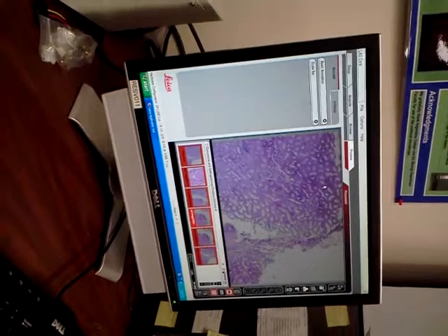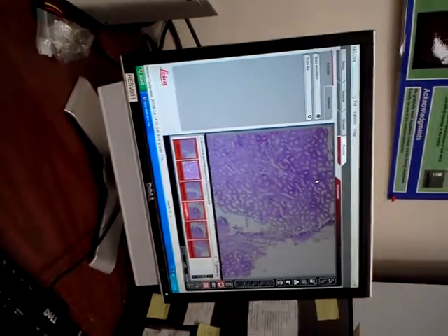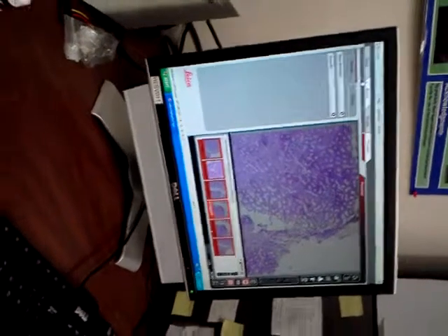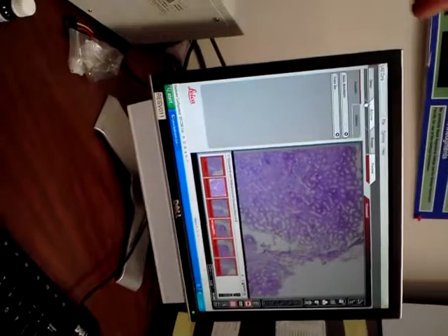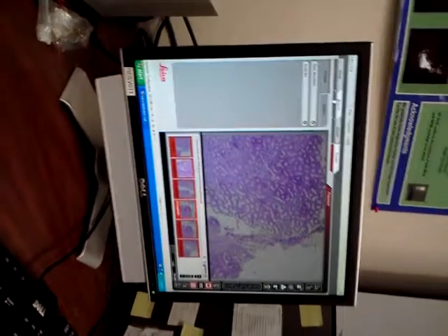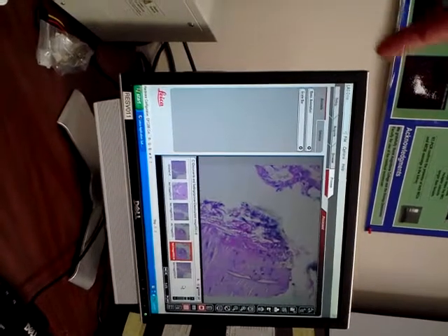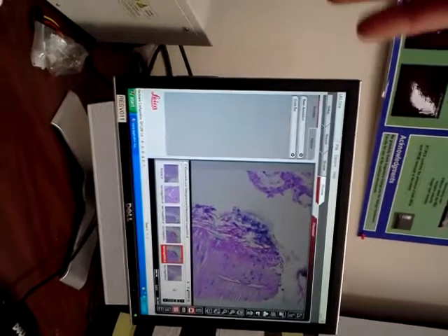This is just the core software, so this would be the exact same look that you'd have on yours, minus the live image, obviously. And we can have the core software on as many computers as you want. And then you're just going to leave the disk? Yeah, it's your disk to have. Oh, that's great, because a lot of times you spend some time screwing around with that, and if somebody else wants to use a microscope, you're sitting there. Right, that's perfect, because we don't want this dedicated to processing.